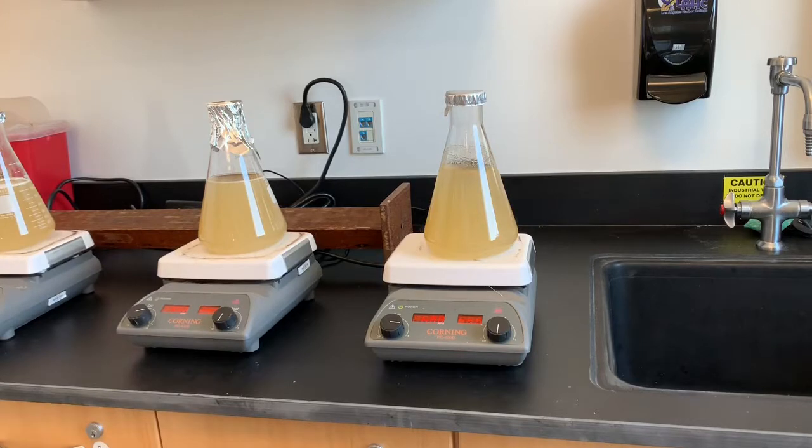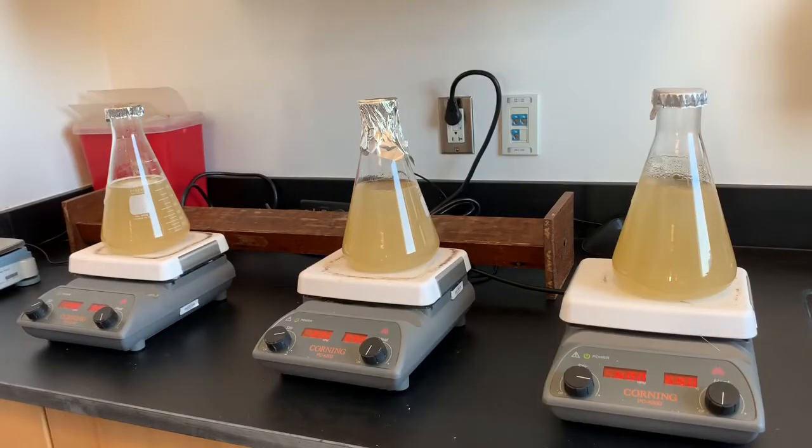These hot plates were just turned on this morning, so they were not previously heated. That will also have an effect on how quickly the water will heat. And while we're doing this, I'm going to prep my other three flasks. Let's keep going.